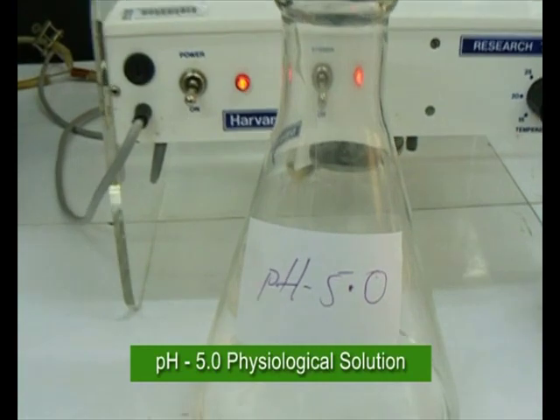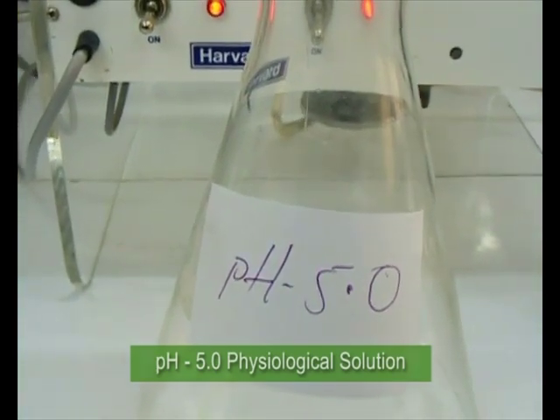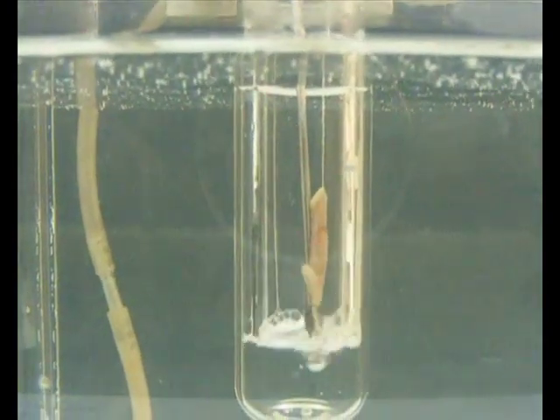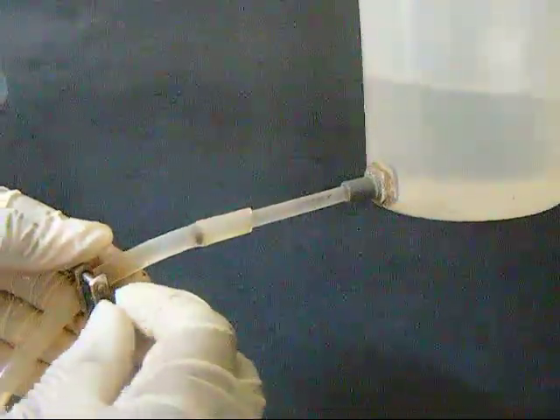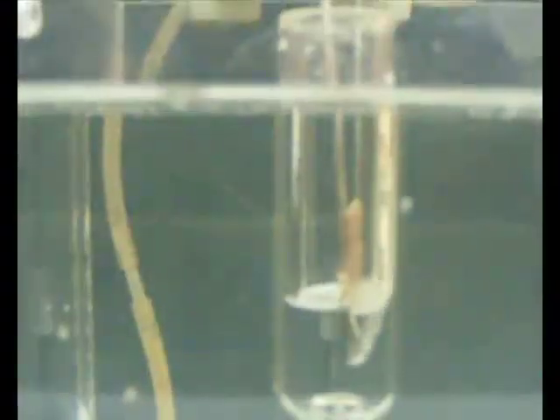Change in optimal pH. The organ bath is drained of normal Ringer's solution and replaced with 50 ml Ringer's solution at a pH of 5 at 37 degrees Celsius.